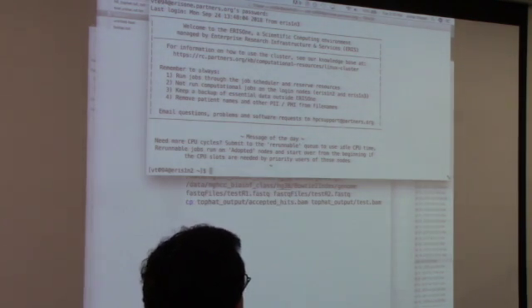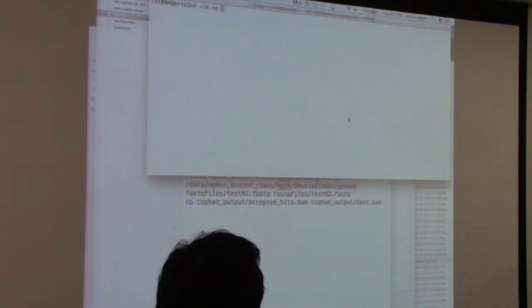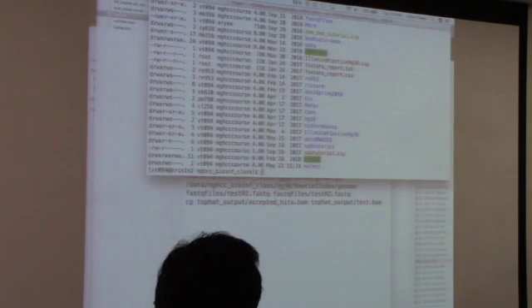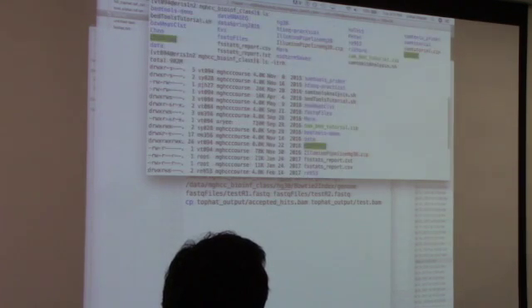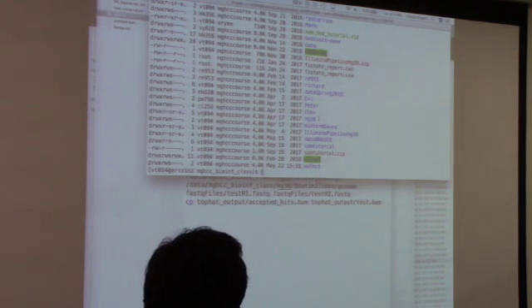Okay. All right, so I'm going to go to, I'm on node 2. So the first thing you make sure when you log in is that you're at node 2, right? Then, this is just for me, this is not for you. And let me see, so HG38 is right here. And let's see if we can change the permissions for that.